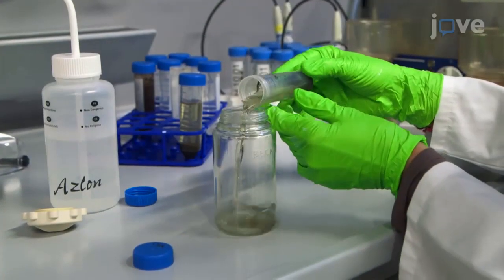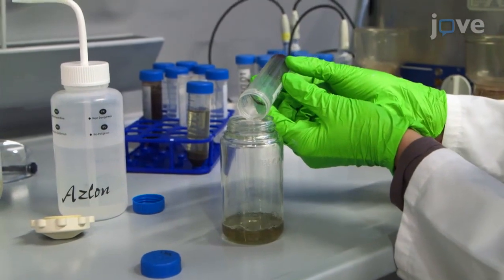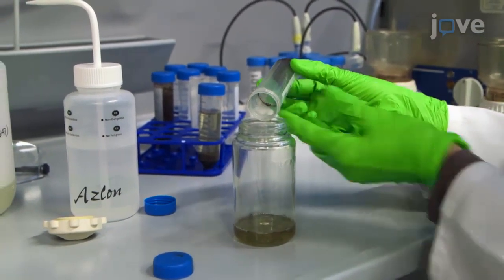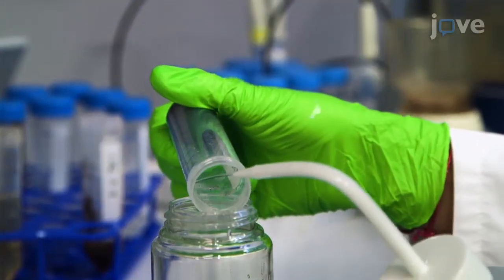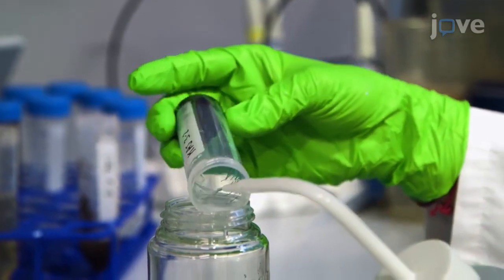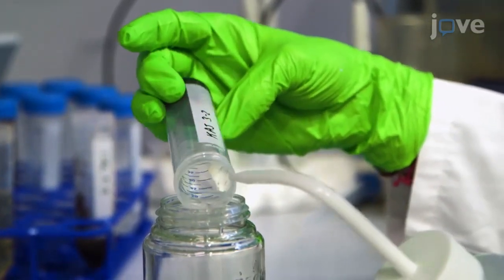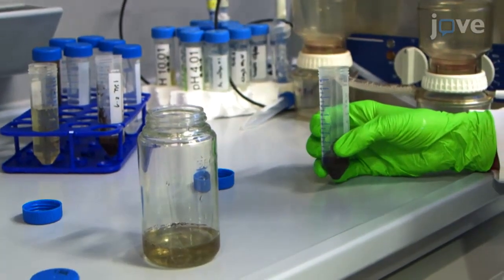Pour all floating and suspended material into a 250 milliliter polycarbonate centrifuge bottle. Ensure that the pellet remains firmly lodged at the bottom of the tube. Rinse the material adhering to the wall of the tube into the same polycarbonate bottle. Use a squirt bottle filled with deionized water, holding the tube almost upside down above the polycarbonate bottle.